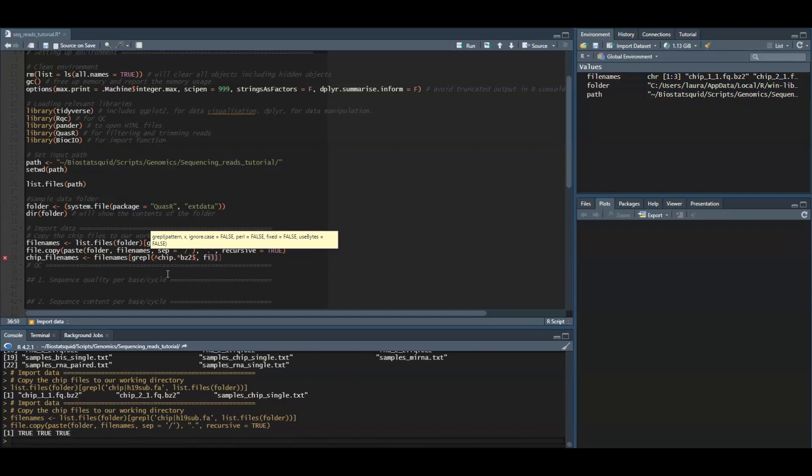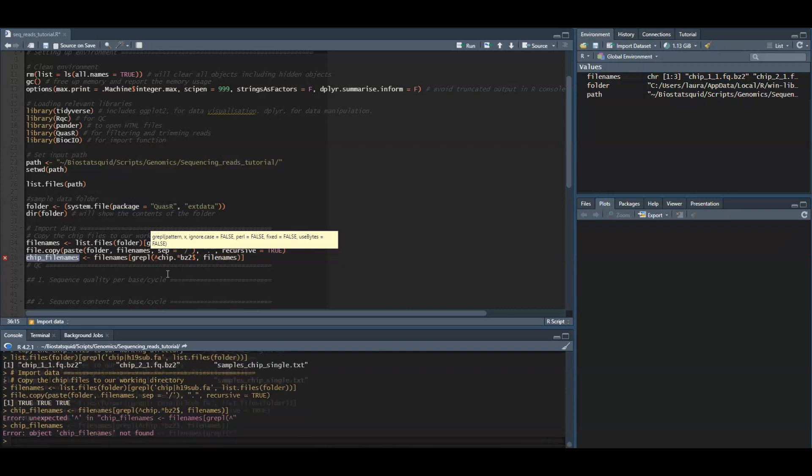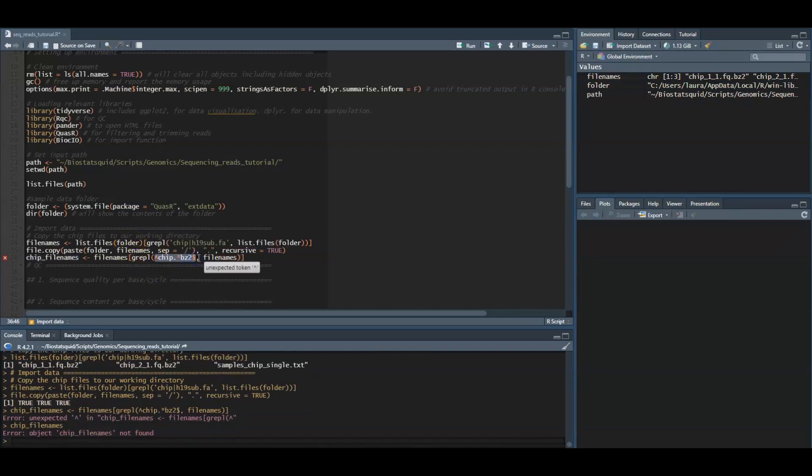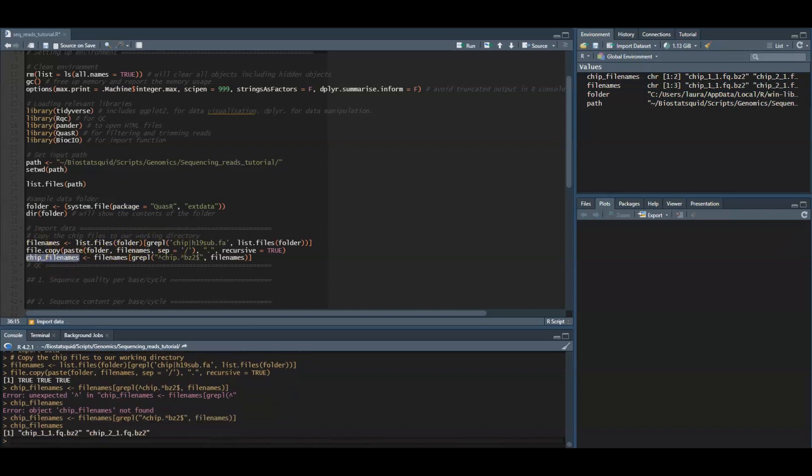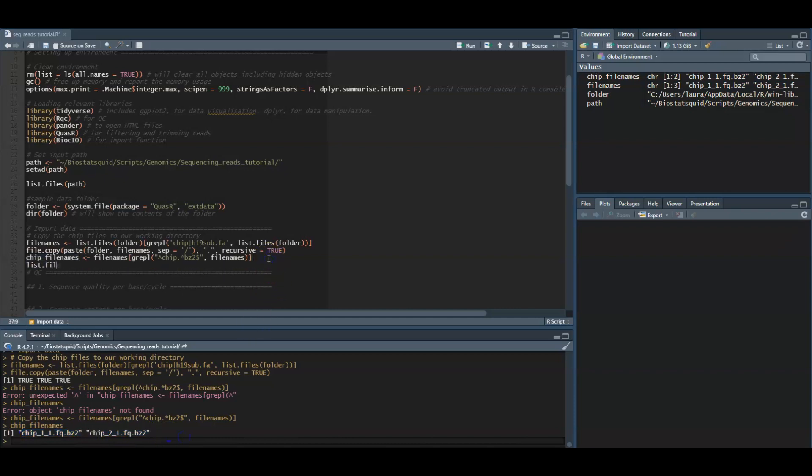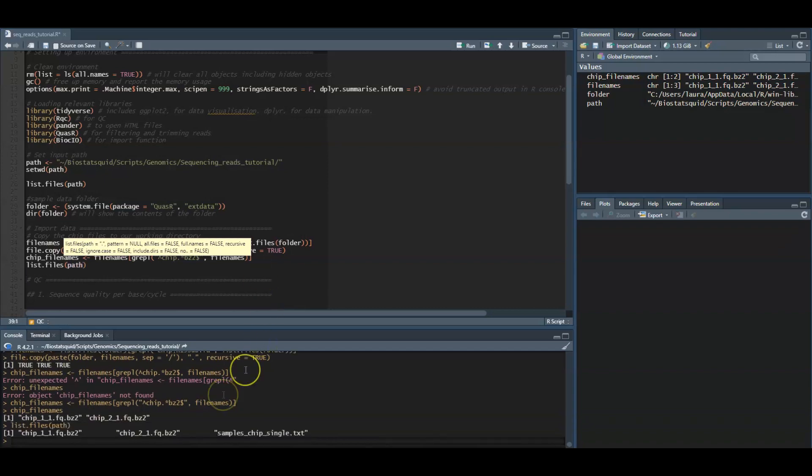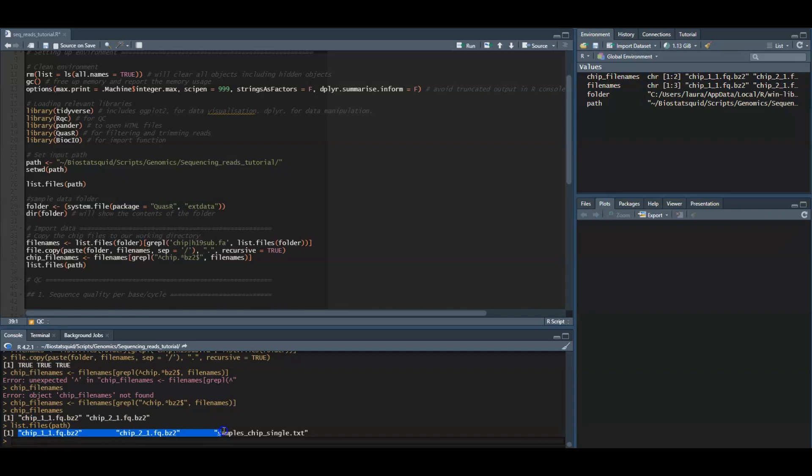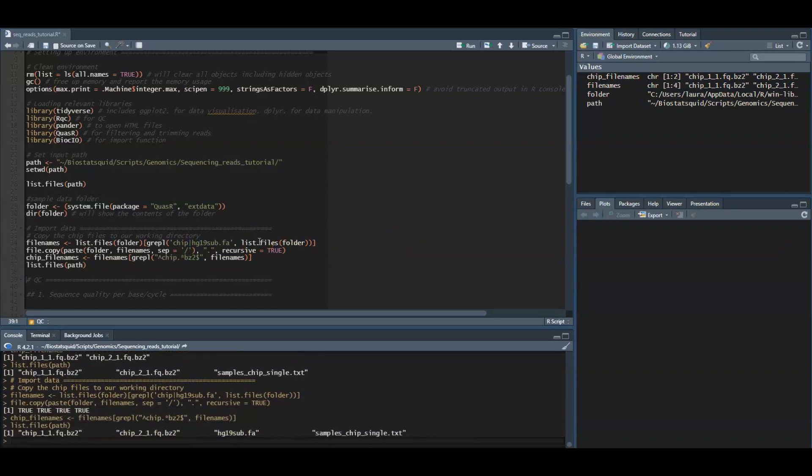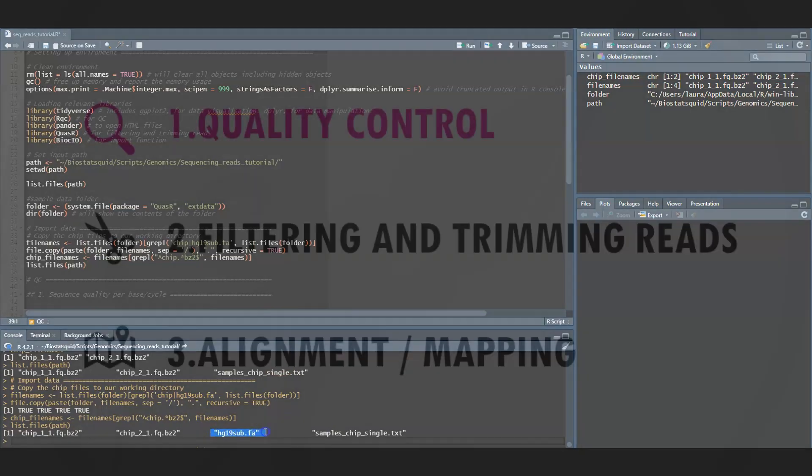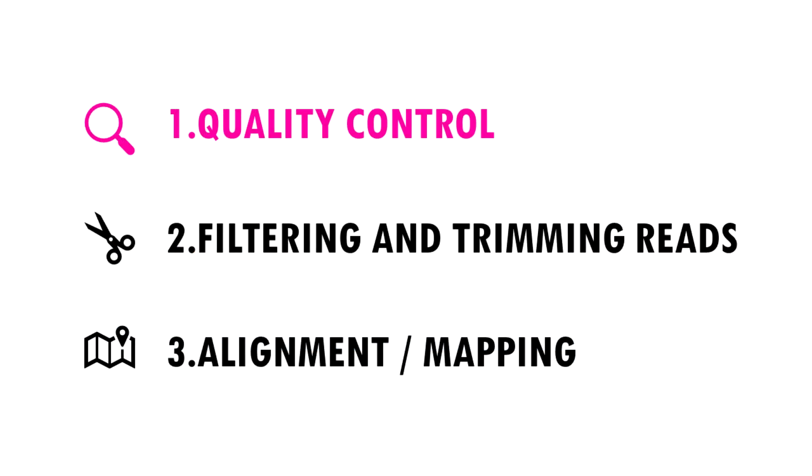These are our two ChIP filenames. Now we list the files in our path, in our folder. We see we have the two ChIP files and now we also find our genome reference file. So let's begin with quality control.